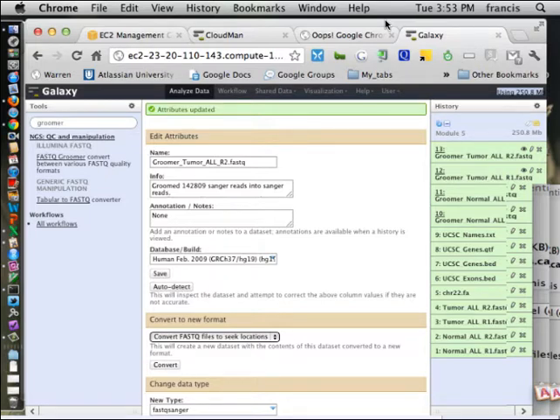So when you're running TopHat in Galaxy, it says alignment. Think about using the Groomer FASTQ output, and not the first one, so the one that you've just created with the right quality score format. Also think about renaming. Once you've finished a step and you have a result file, rename it so that you can keep track of what you have done all along.